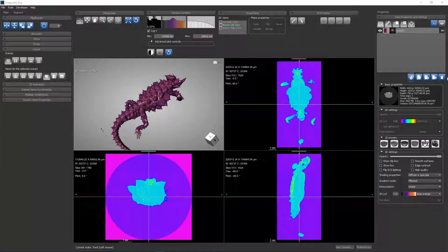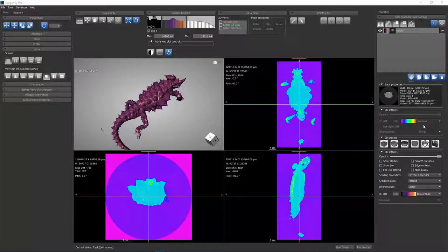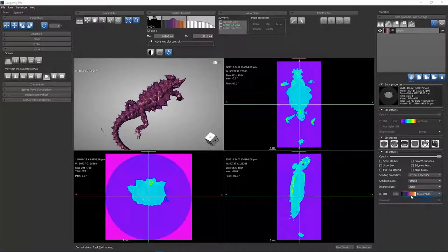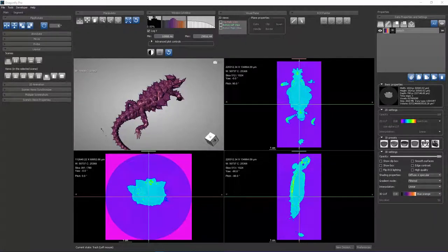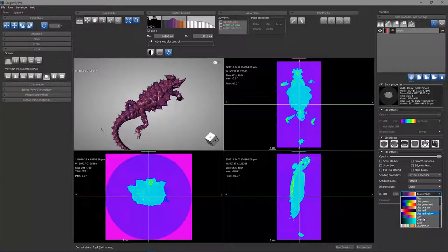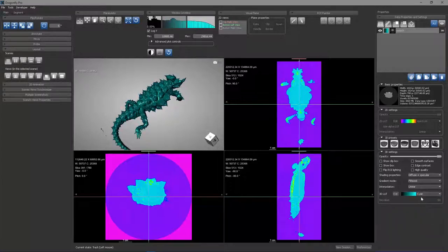In my workspace you can see that in the MPR or 2D views I have the spectrum lookup table for my 2D lookup table, and in my 3D view I have a lookup table called blue-orange. In either one of these places, you can choose the drop-down to change to a different lookup table.